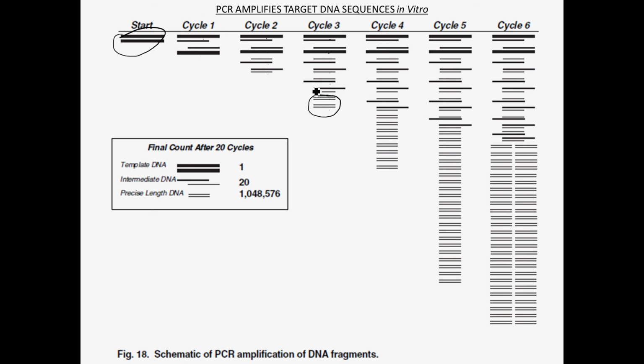These other sequences up here, these other fragments up here, right, will all have sort of these overhanging areas that are not part of the target sequence that we're looking for, and that's okay, right? But that's just the mechanism here. You cannot not get these overhanging sequences here, but that's after 3 cycles.